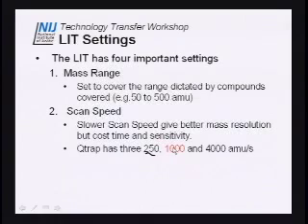250 here. Oops, I have to press the right button. 250 gives you better mass resolution. In other words, I can separate 303.3 from 303.5 or something like that. But we set our scan speed at 1,000, which gives us roughly unit resolution, and it covers the entire mass range, 50 to 500. How fast? Half a second. If you set it to 250, it takes 4 times longer to scan the same set of masses, which means the time it takes to produce an EPI spectrum is longer. But you'll get better mass resolution. If that's what you're after, then it works fine.